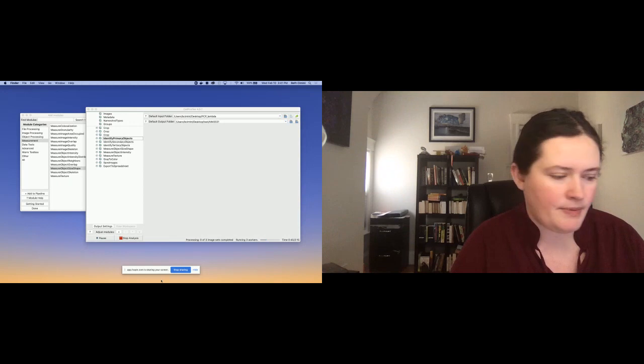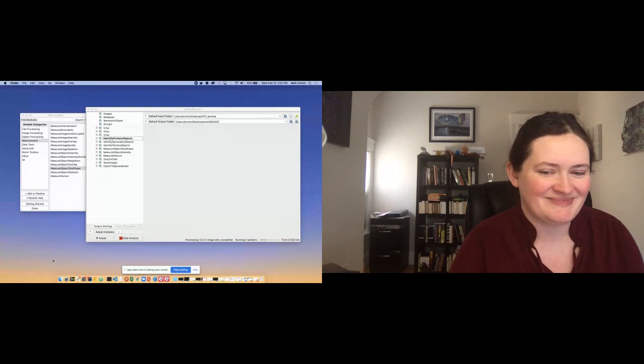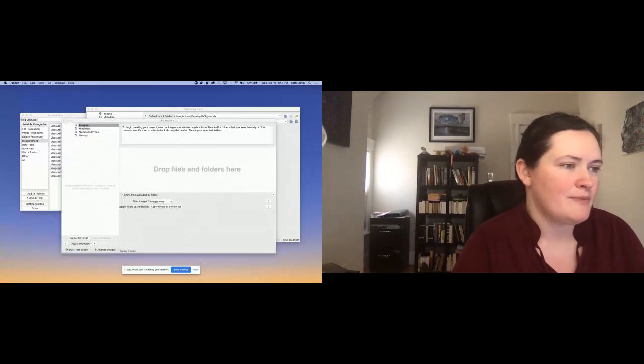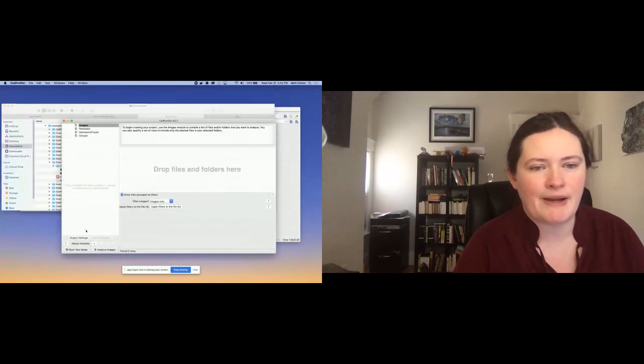I can pull up my other CellProfiler window, which is now running away from me. Okay, this is rude. All right, so I can also, finally, open up an example pipeline. These are all of the examples that we have on our website. I can pull up what we call the speckle example pipeline.